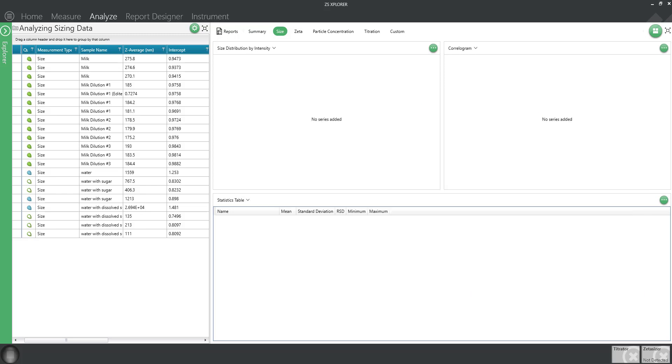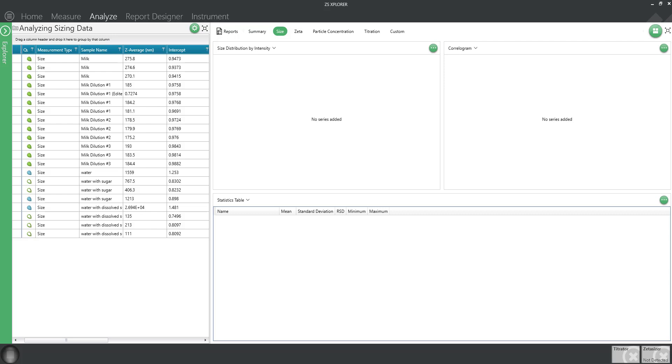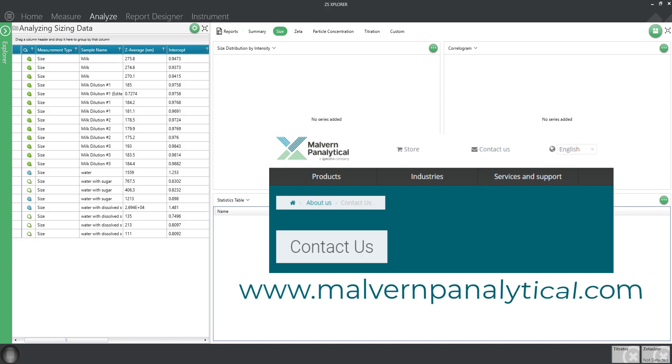Let's discuss exporting raw data files with the file extension .zmes that can be opened in the ZS Explorer software. These are the types of files you can send to our help desk for support if you have a question about your data.